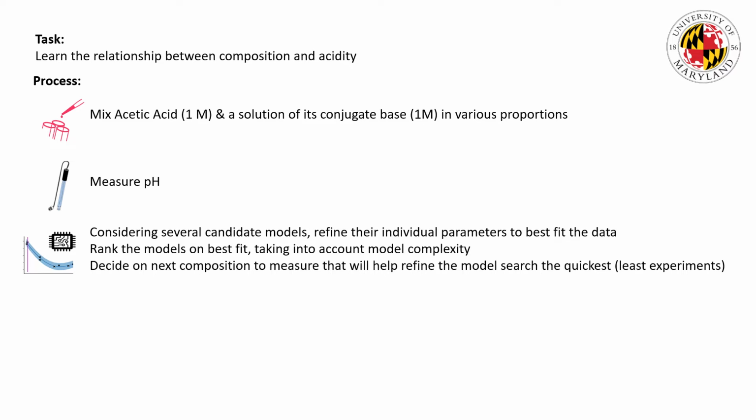The robot then decides on the next composition to measure, with the initiative of trying to conduct the least experiments possible, when the initiative is trying to refine the model search or rank the models the best.